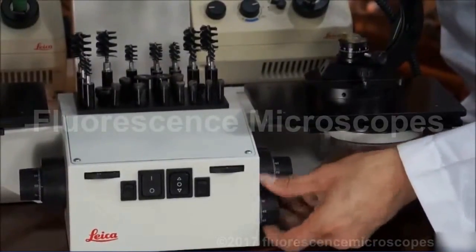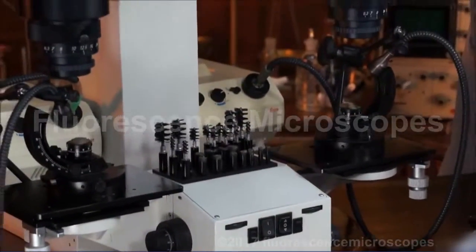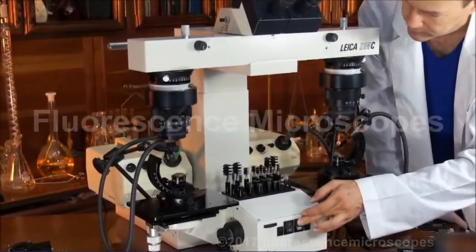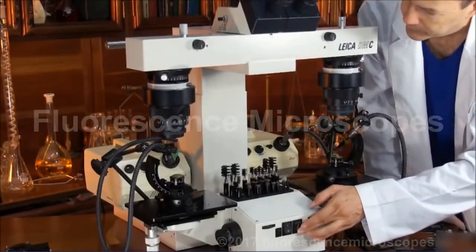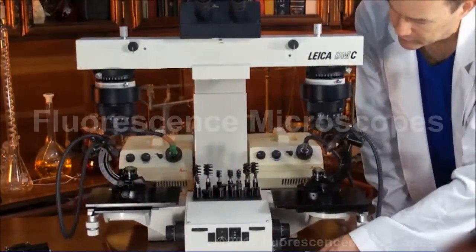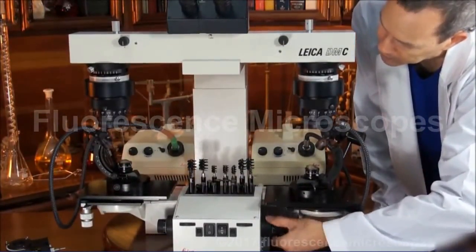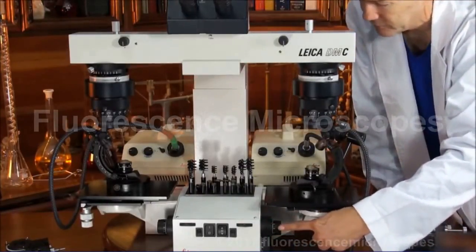This has a motorized focusing system for bringing the whole bridge assembly up and down — this is the button for that. But then you'll want to use your individual focusing on the left and right to synchronize the focal distances on each side. Coarse focus and fine focus.